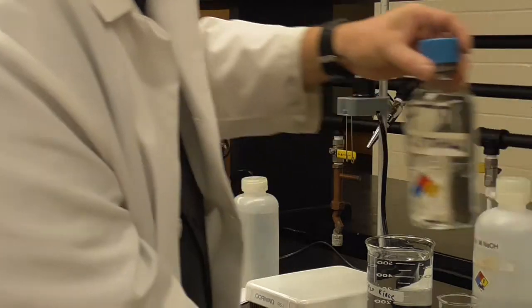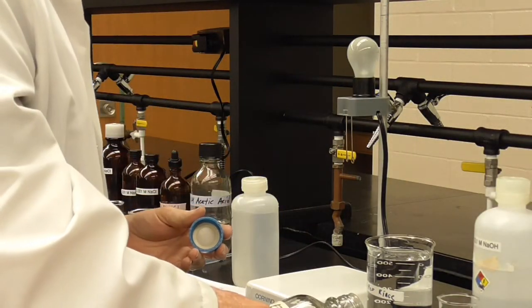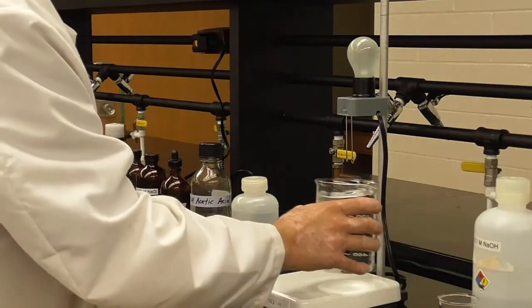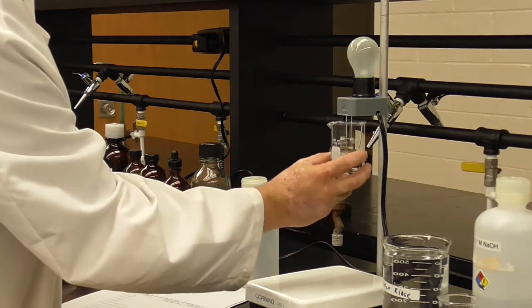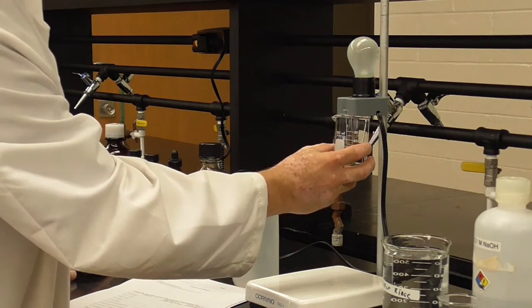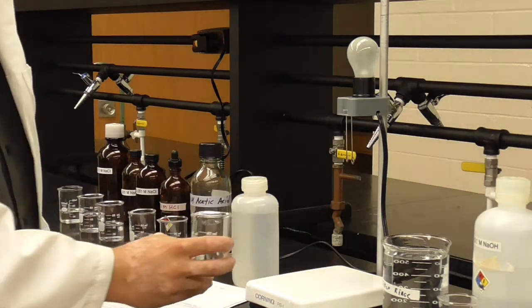Ethanol is next. Ethanol is what's in beer and wine. So it's an alcohol. Go ahead and clean this off again. All right, ethanol. Here we go. Nothing at all. So ethanol is a non-electrolyte.